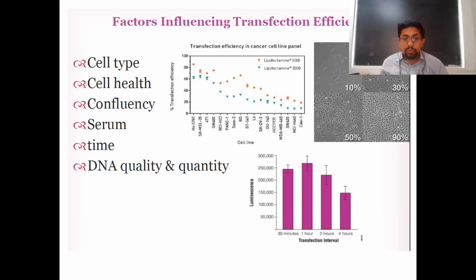cells. You must be knowing that any animal cell culture media, you must have studied this in your first semester in analytical biochemistry 1, because I had taught in detail about animal cell culture. So for that, whatever modified medium you use should have serum along with it. You have the fetal calf serum, fetal bovine serum. All these things also determine the transfection efficiency.